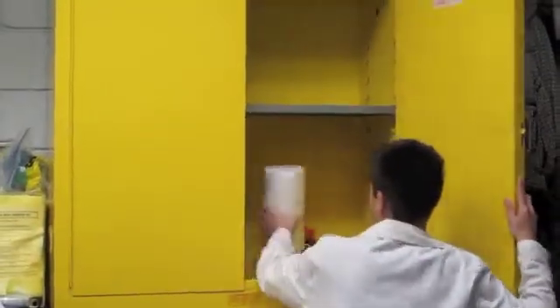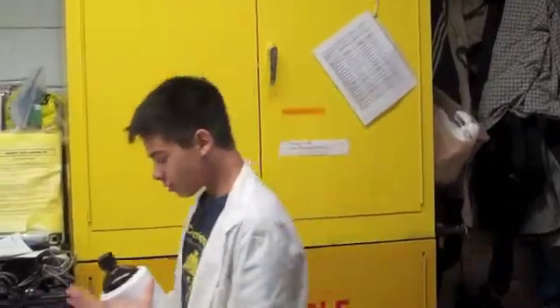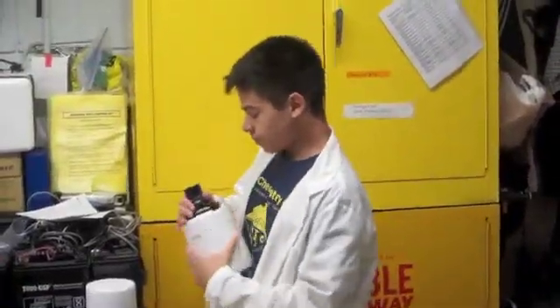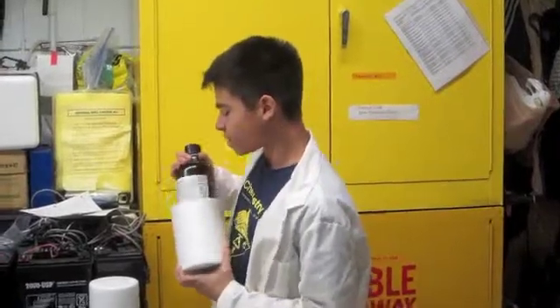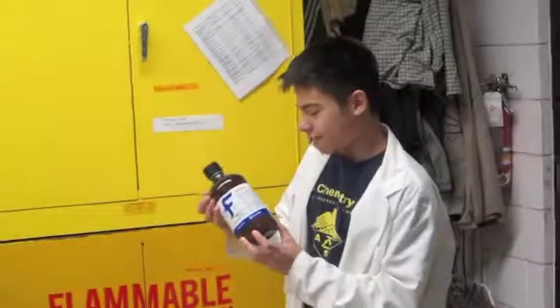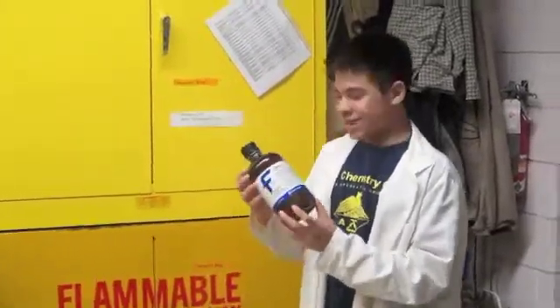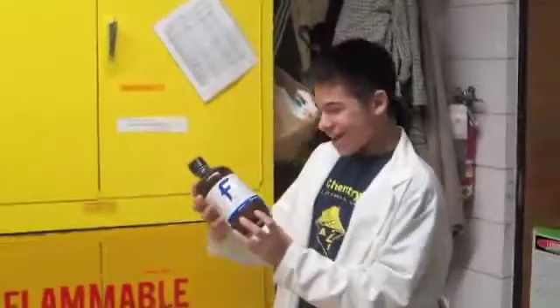Personally, my favorite chemical that we have in storage here is the chloroform. So, whoa, there's like some on the exterior, you can smell it. It smells like almonds, it smells like candy. The outside is sticky. Yes, especially chloroform on the outside of this.